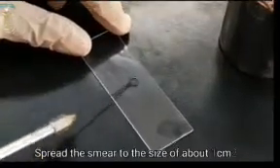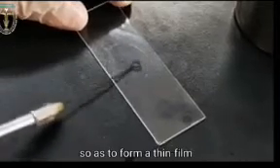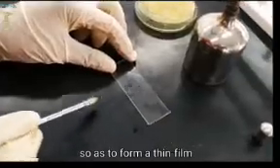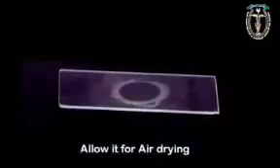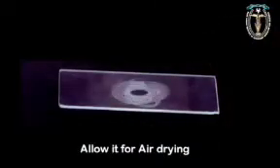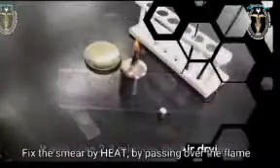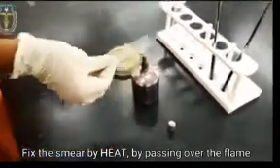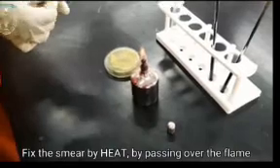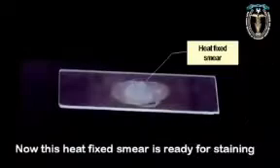Then you spread the smear to about 1 square centimeter, as you can see in the video, and allow it to air dry for about 2 to 3 minutes. After that, you pass it over the flame gently. That is what we call fixation of the smear.